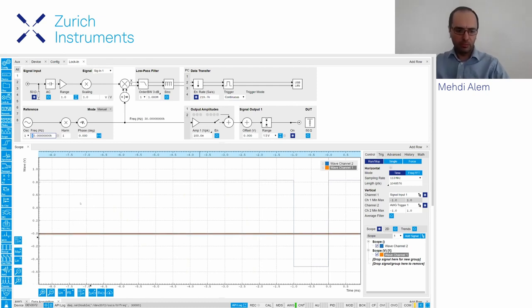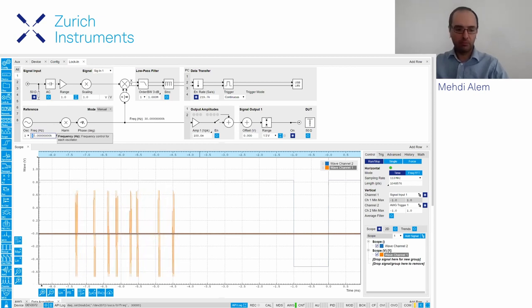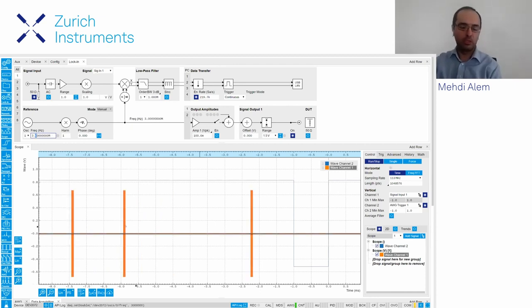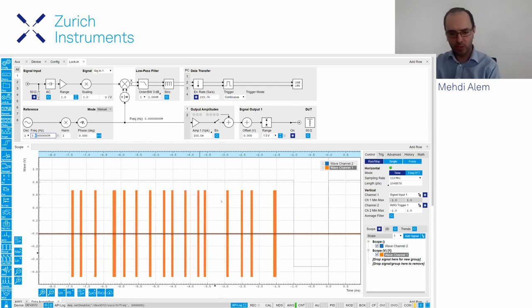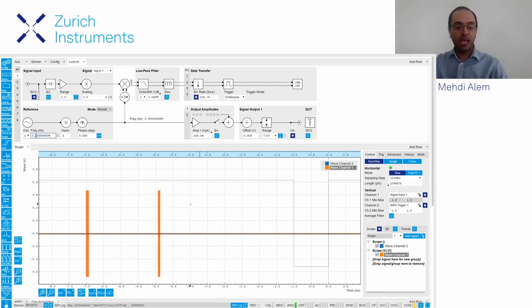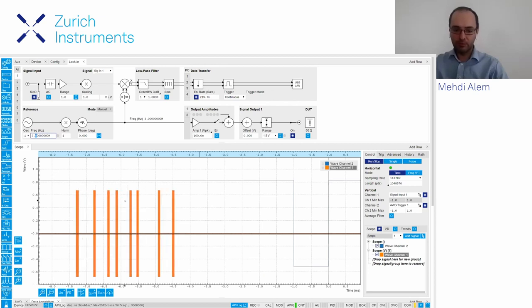The modulation is usually at the frequency of your cantilever or any sideband of that. If I increase the frequency you'll see it's modulated at higher frequency with more oscillations. That's the signal we are receiving. The first thing you'd like to do is demodulate that signal and acquire the amplitude and phase, depending on the type of application or AFM mode you're using.